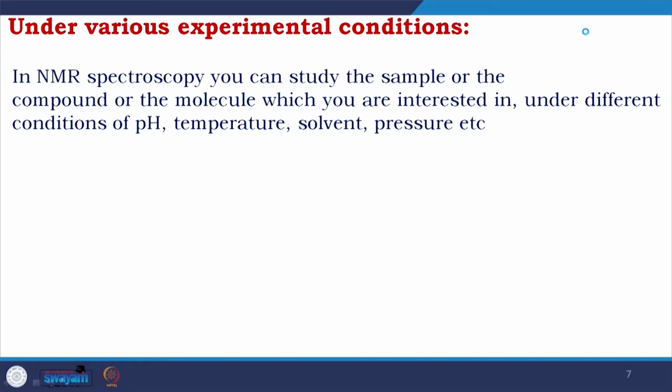Also, in NMR spectroscopy you can study the sample or the compound or the molecule which you are interested in under different conditions of pH, temperature, solvent, pressure.